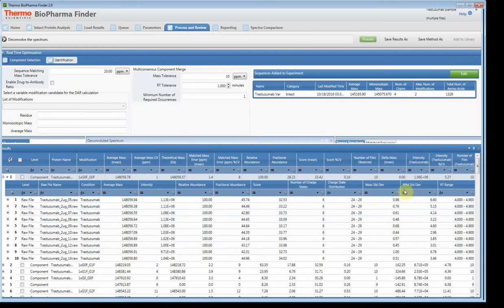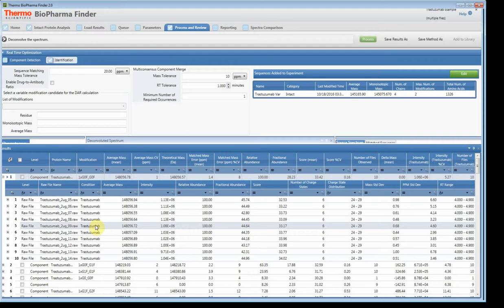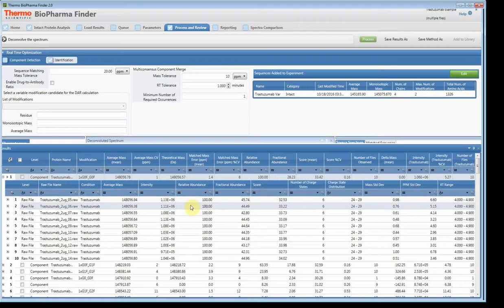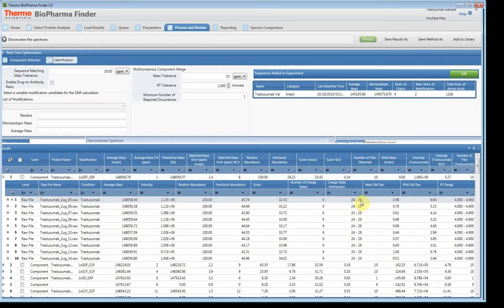Here's the intensity, and the CV is calculated for the specific group or condition. Going back to the beginning — I assigned the condition for each dataset. In this case, I assigned all files the same condition since these were technical replicate injections. If they were different conditions — control, stress, whatever — you would get individual intensities, CVs, and number of files per condition, allowing a true comparison across raw files. At the raw file level, there's a new charge state distribution column showing the range — for example, we saw charge states 24 to 29.